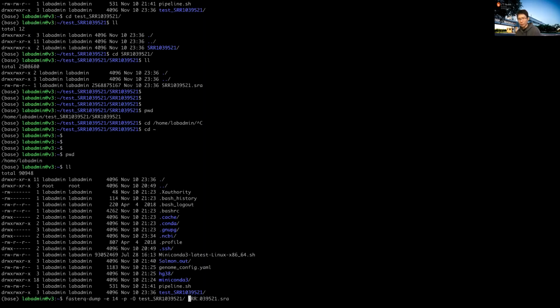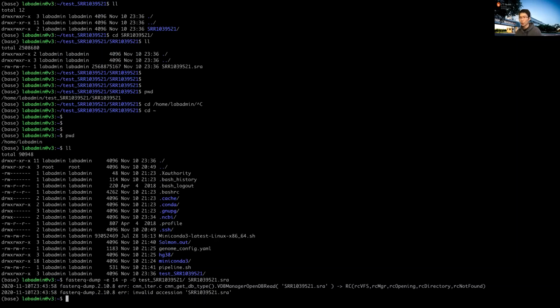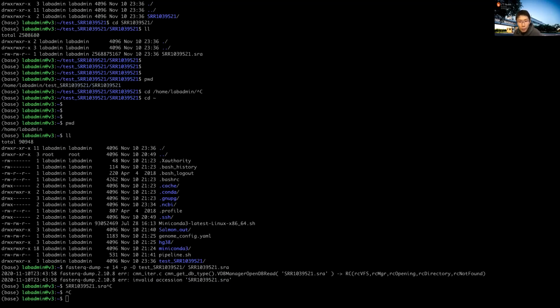So if you simply hit this, you couldn't access this specific file. You need to let the function know that this file sits within another directory. Oops, I probably need to paste again. Let me copy again. I think there might be one more directory to go down for the file.